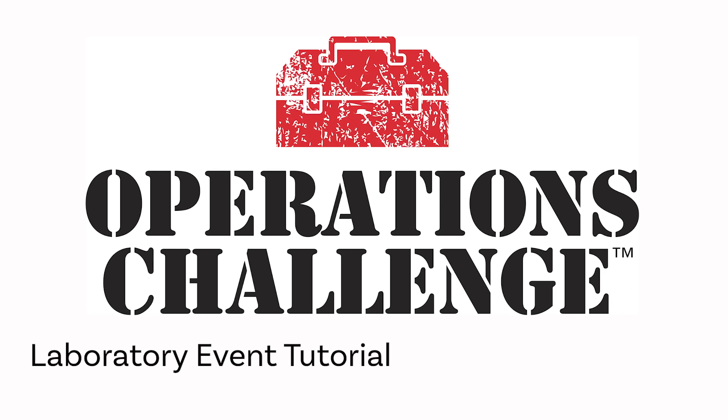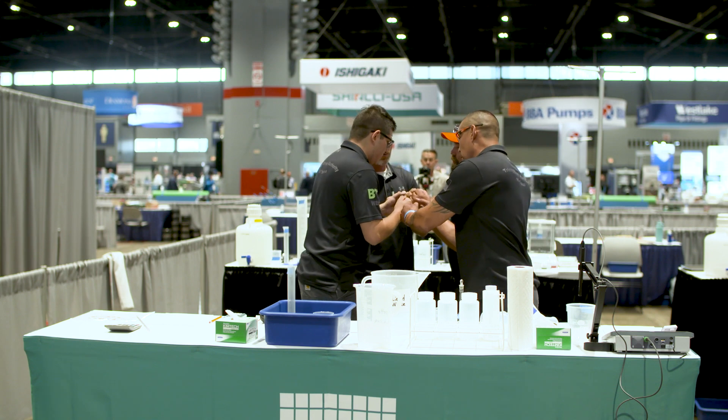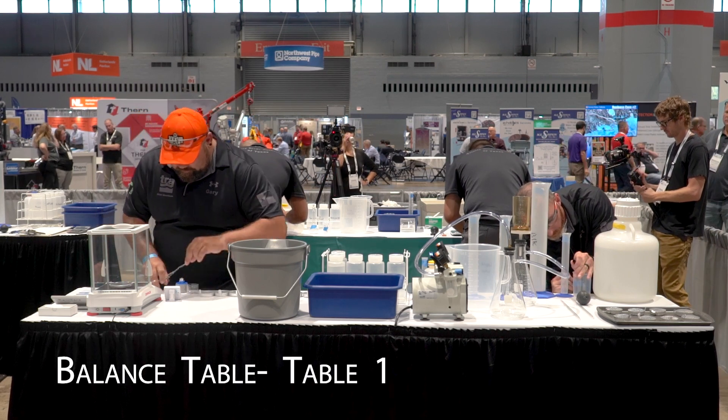Alright, let's get started with the WEFTEC lab event. As you can see, the competitors are in between the two tables. The balance table we're going to refer to as table number one.